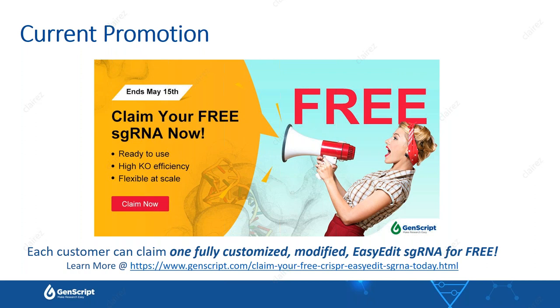So one more question. What are the physiological changes in cells after gene editing? The physiological changes. Go ahead. I think this depends on what gene you're editing or what target you choose. It really is more molecular biology of your target of choice. If it's supposed to be a vital gene or a lethal gene, or something that affects survival or viability, or a certain kind of protein encoding gene, then this will be the major change you want to observe in the cells. Otherwise, besides the genome sequence change, we are not expecting substantial physiological changes.